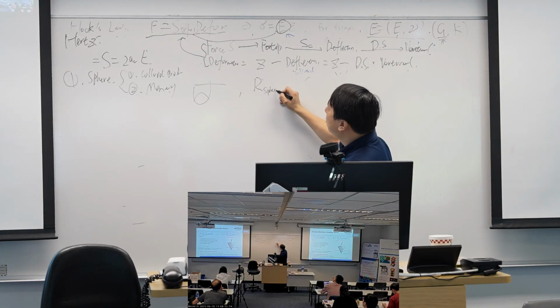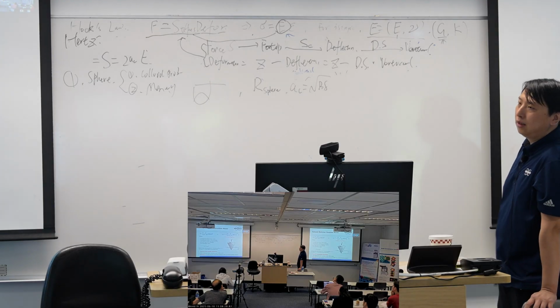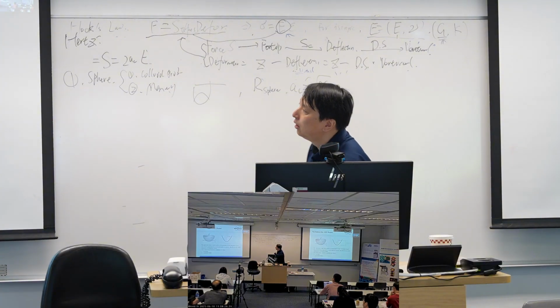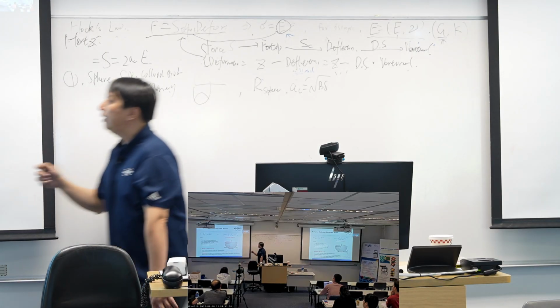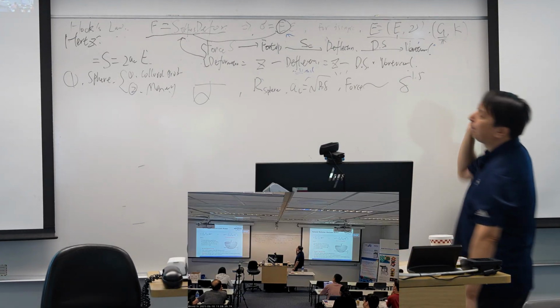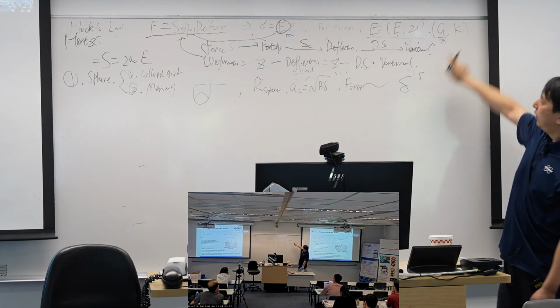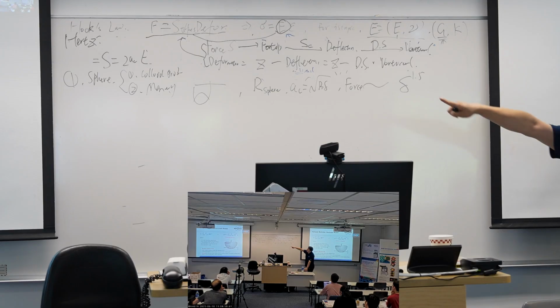That's just the radius of your sphere. And then the AC is the square root of the radius times the delta, and then you can use the Hertz model directly. So the force is proportional to delta to the 1.5. The force is your measured quantity, the delta is your measured quantity, so you can get the modulus directly from the coefficient.